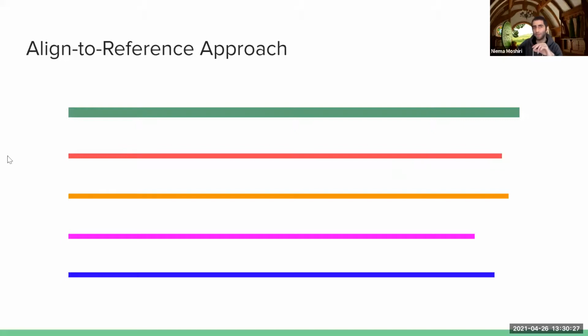So what if, instead of aligning my sequences with each other, because I have this high confidence reference genome, I align each of my consensus sequences pairwise with the reference genome? I do the red sequence pairwise aligned with the reference genome. And independently, what if I do the orange sequence pairwise aligned with the green genome? And also independently, the purple genome pairwise aligned to the reference genome, and so on. Does that starting point make sense? Basically, let me do a pairwise alignment of every single one of my consensus sequences against the reference genome.